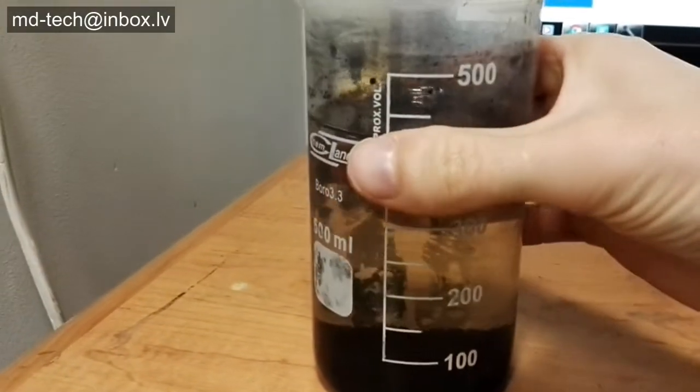Okay, all platinum group metal flakes are coming out and settle on the bottom of the flask.